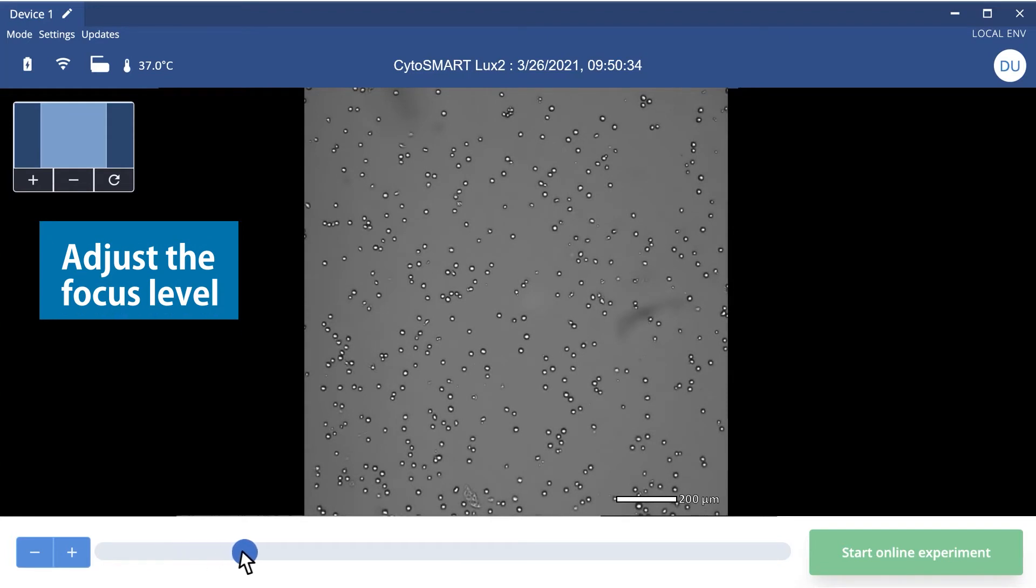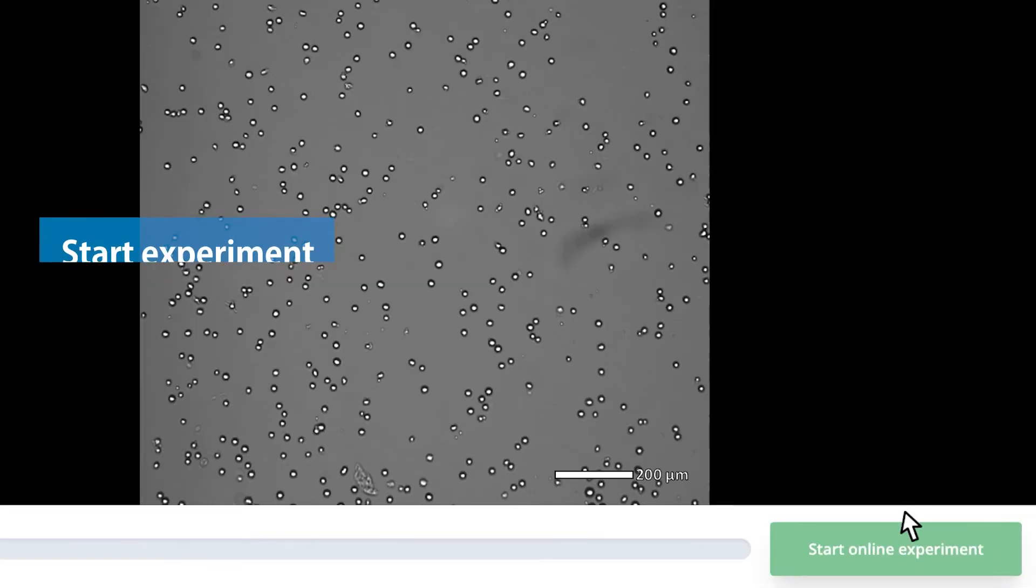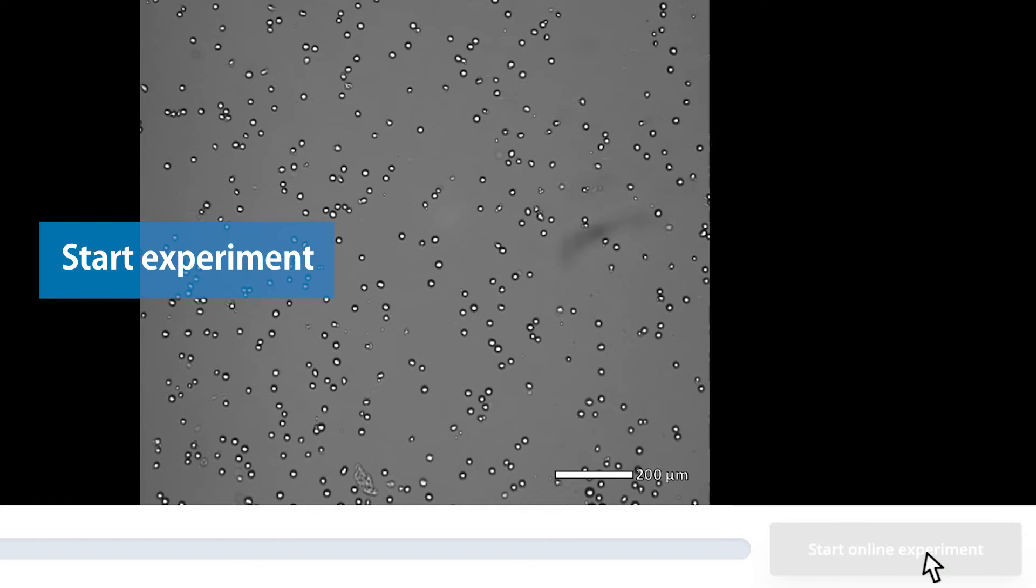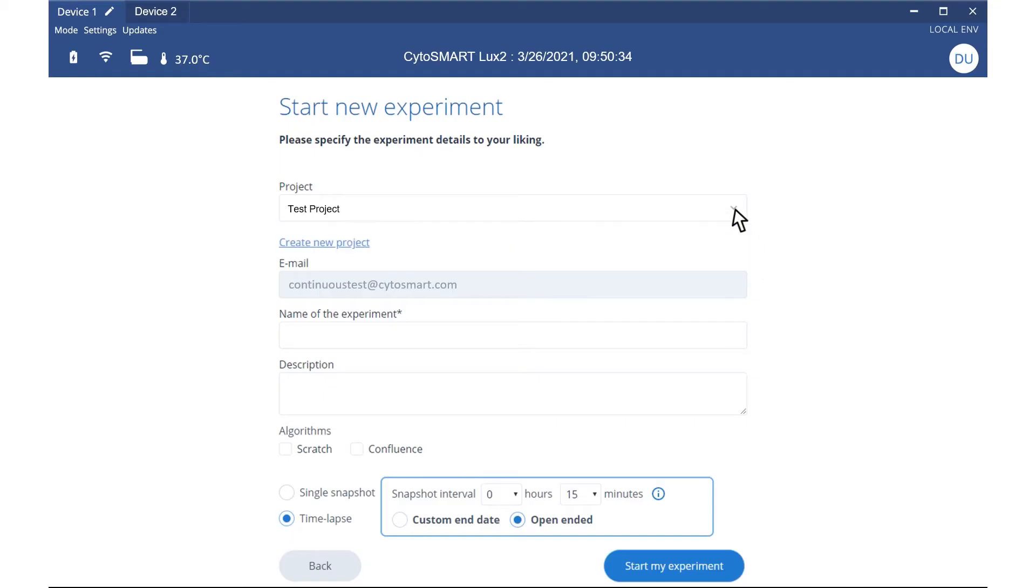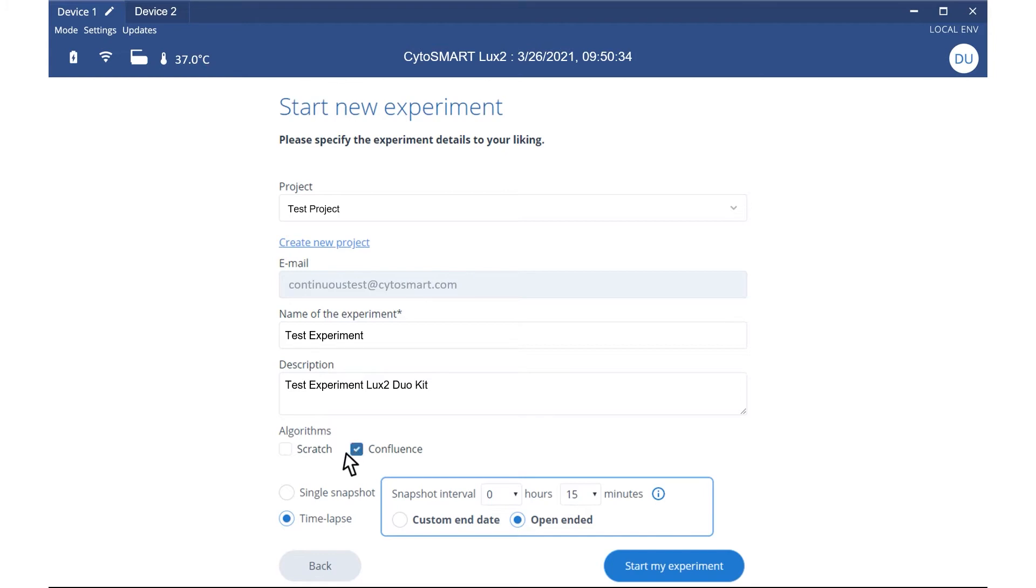When you're satisfied with the settings, you can start your online experiment. Assign your new experiment to a project and insert experiment name and description. Select your analysis algorithms and whether you want a single snapshot or time-lapse imaging. Choose your time-lapse imaging interval, set an open or custom endpoint, and start your experiment.